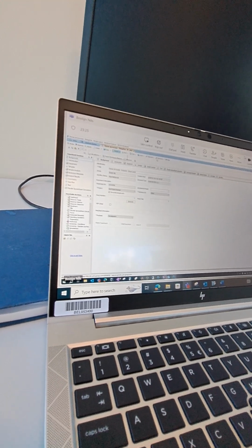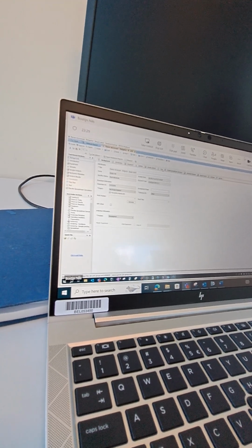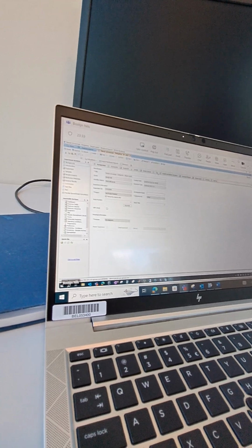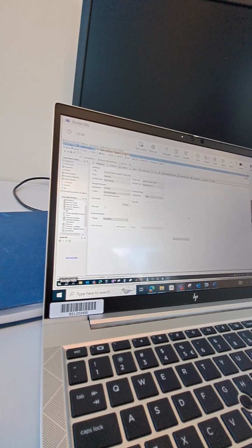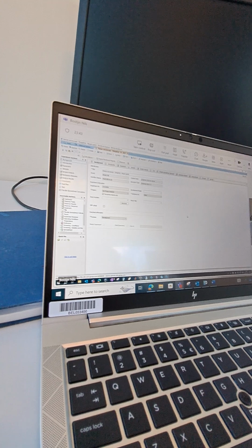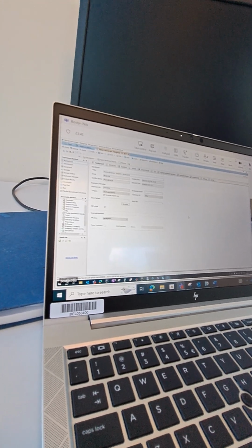For example, here, if you add the text, you could say measurements day 1. Then you can add a second one, measurements day 2. You can work like that. But if you are busy with your experiment, when it's ongoing, you can always ask me, and we can have a look at what's best: to make a new ELN or to put it under the same ELN.